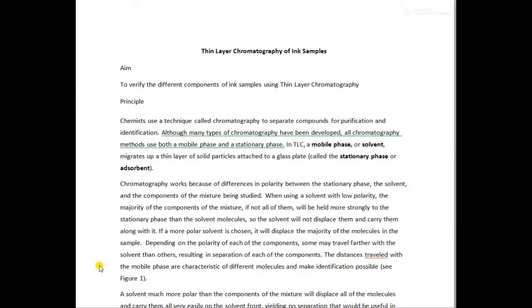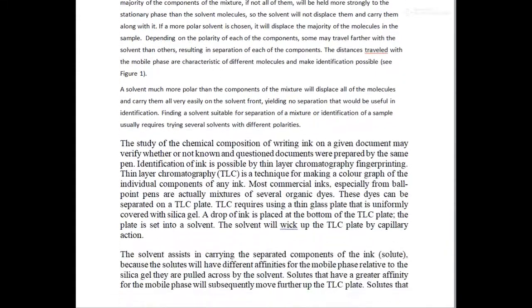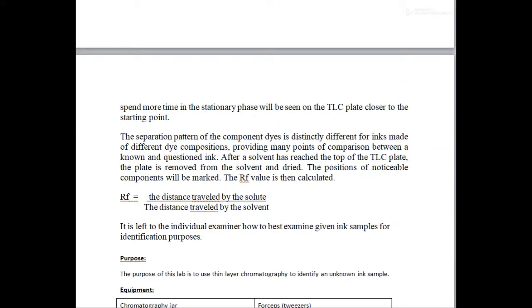Based upon this, we calculate an RF value. Now, what is the RF value? The RF value is the distance traveled by the solute divided by the distance traveled by the solvent. Okay, there's a spelling error. I'm just checking it. So how do we do this particular experiment?